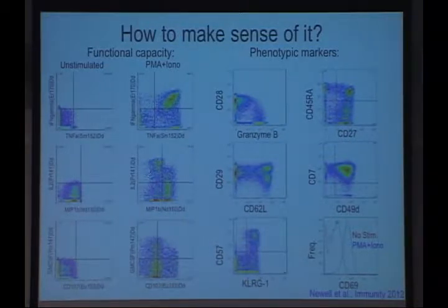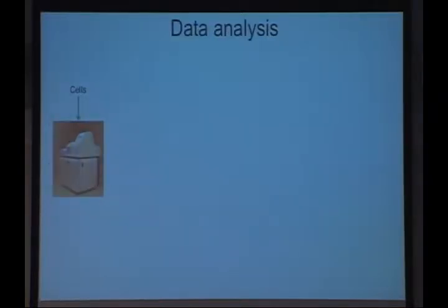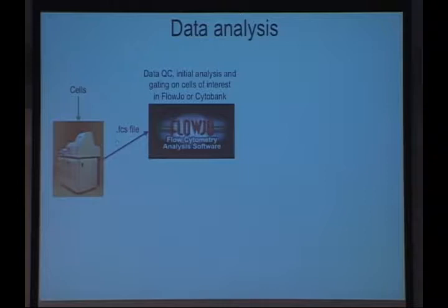And it's nice with the CyTOF that we have pretty good signal when it comes to looking at a sledgehammer stimulation induction of cytokines. In this case, it is a probe of functional capacity because we're just hitting them really hard. In general, this is what I want to go over in this talk: we put cells into the CyTOF, and then we get an FCS file out. And I showed you some FlowJo analysis.